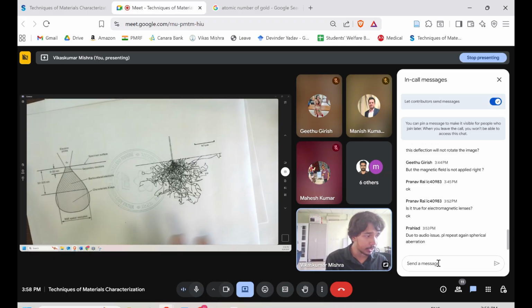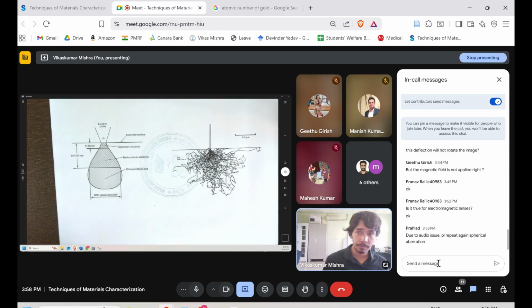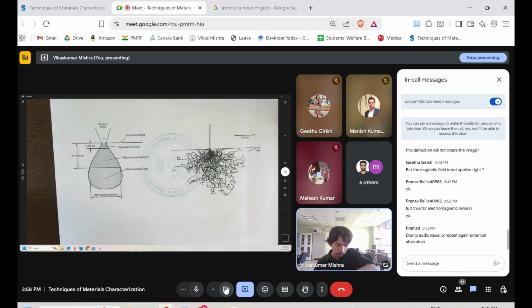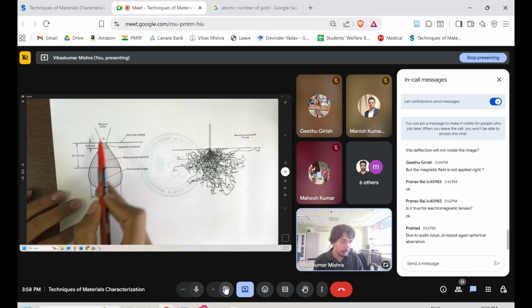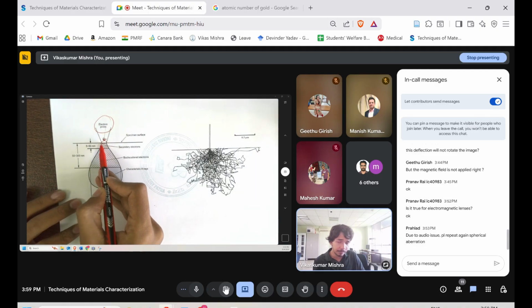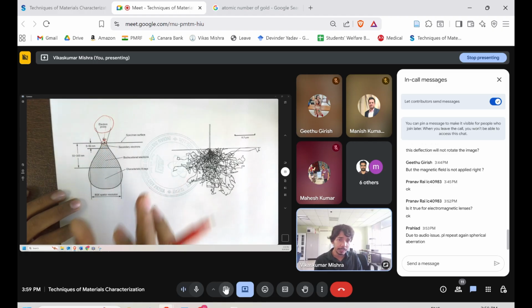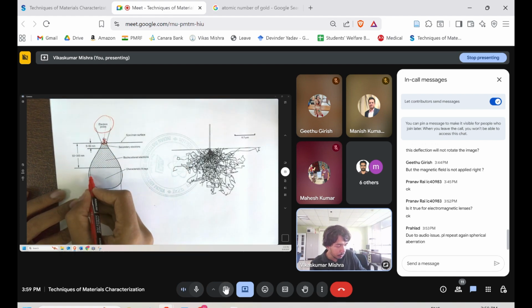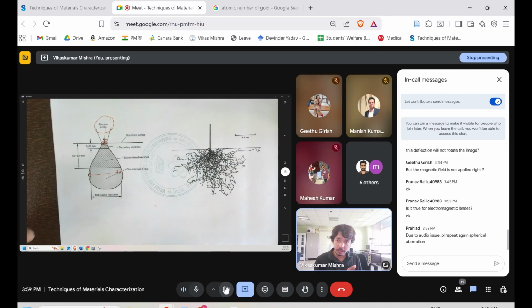Okay, let's discuss a few concepts before we move ahead. So this is our electron probe. It's coming, and it will have some diameter. We might think that the probe size is the resolution. No. Even though you are focusing on this region, it will extract information from this much region. So different signals we are getting.